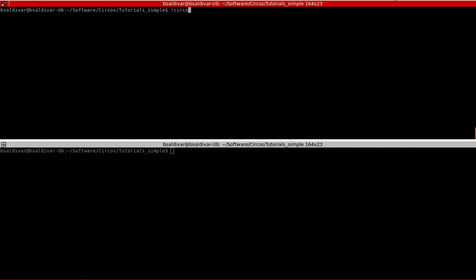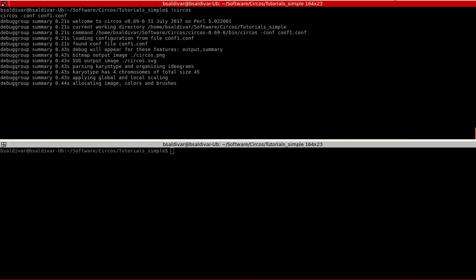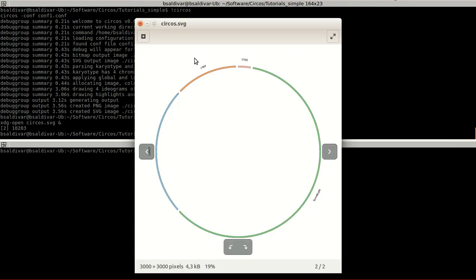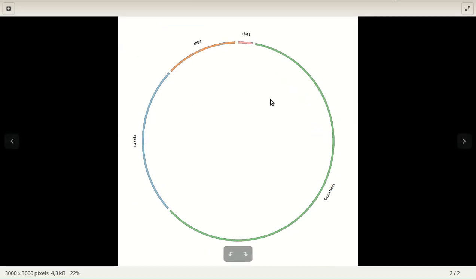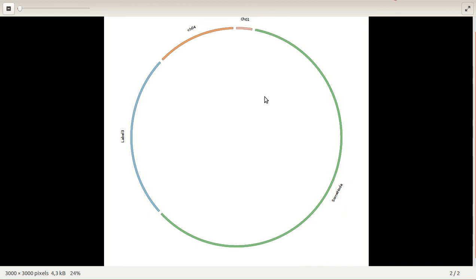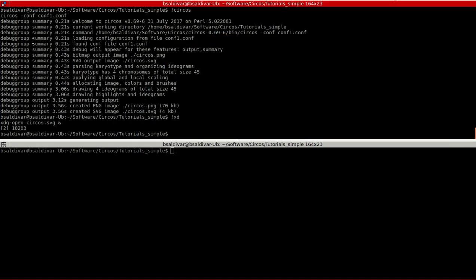We're going to run again. So the radius of these nodes is supposed to be smaller, but apparently it's not very different.